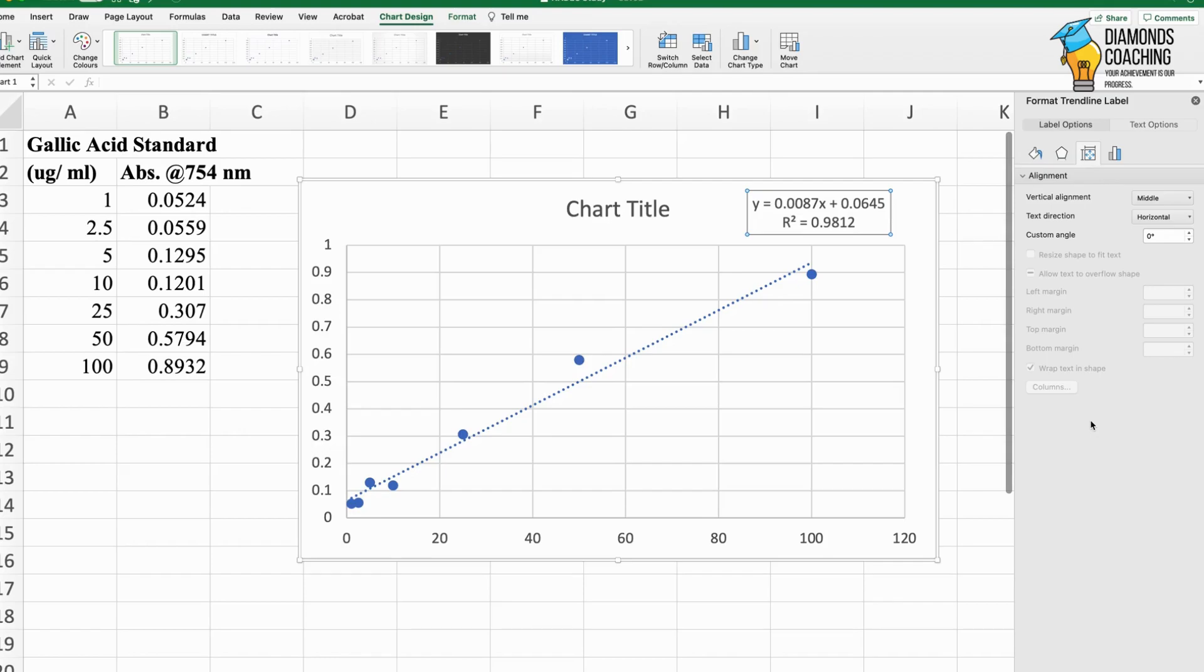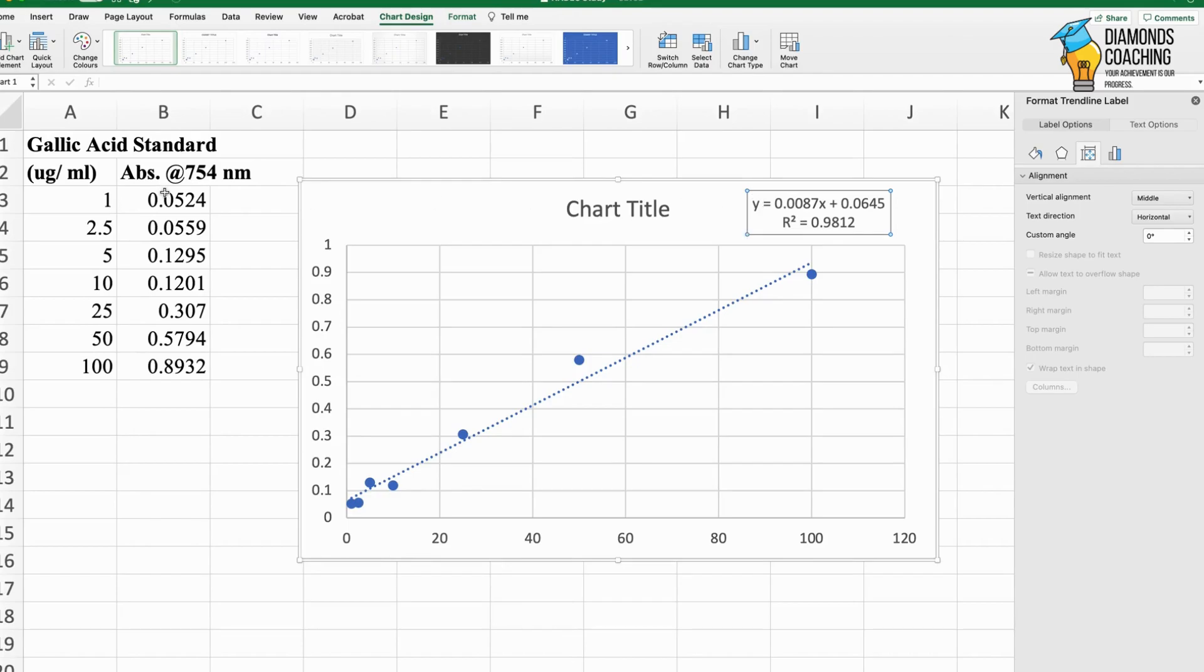I will plot my graph, make the trend line linear, then select to display the equation on my chart. This is the equation y = mx + c, where we have the value of m and c. We put y as the absorbance value of our sample and then calculate the concentration of our unknown sample.